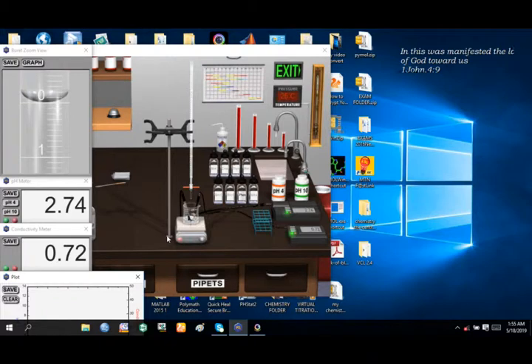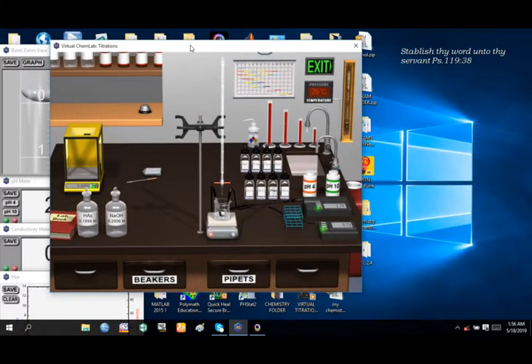Now, let us see what happens in this experiment. When you observe the results, we'll first of all move the lab so that we can see what is happening clearly. Now, this is the concentration of sodium hydroxide, which is 0.2006 molar solution, and the acetic acid is 0.1894 molar solution.